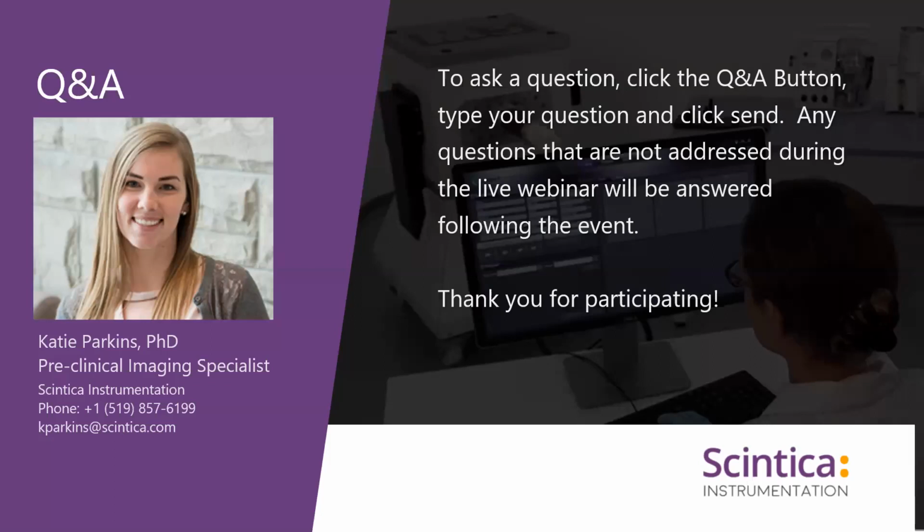So one of the questions that came through is probably for Katie. Is it possible to integrate, for example, optical imaging with other imaging modalities such as CT or X-ray, similar to how you would with PET imaging and have multimodal imaging?